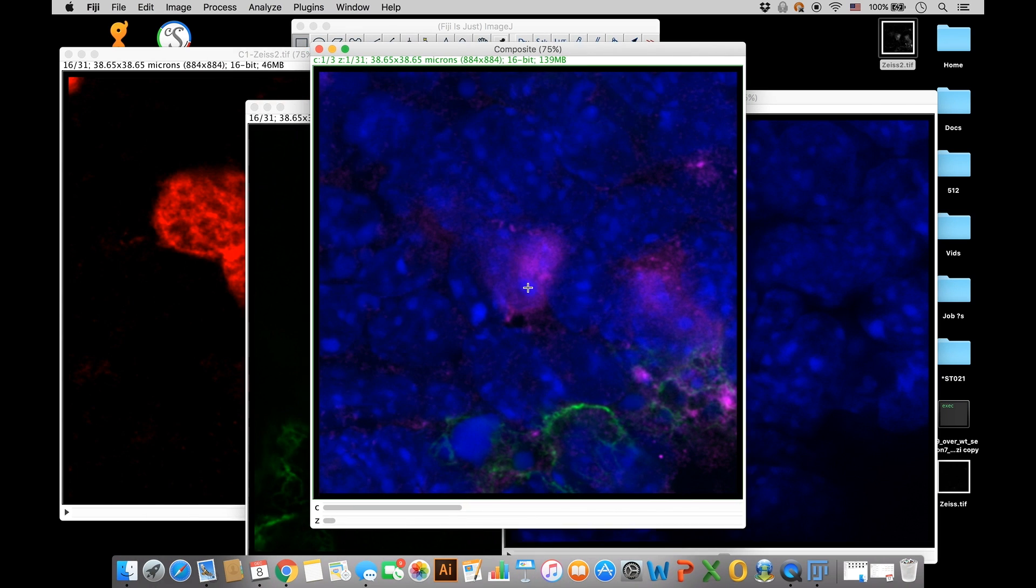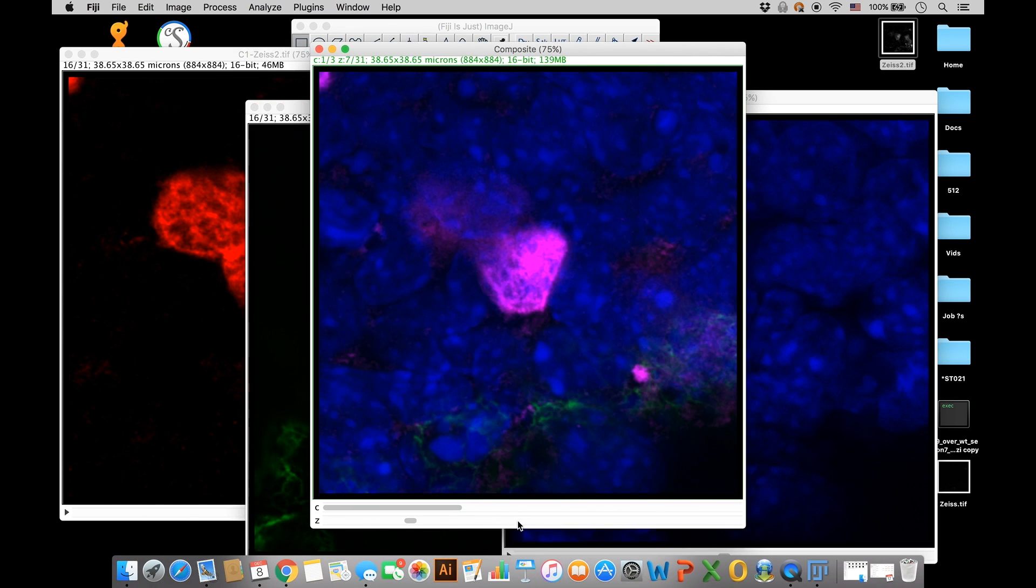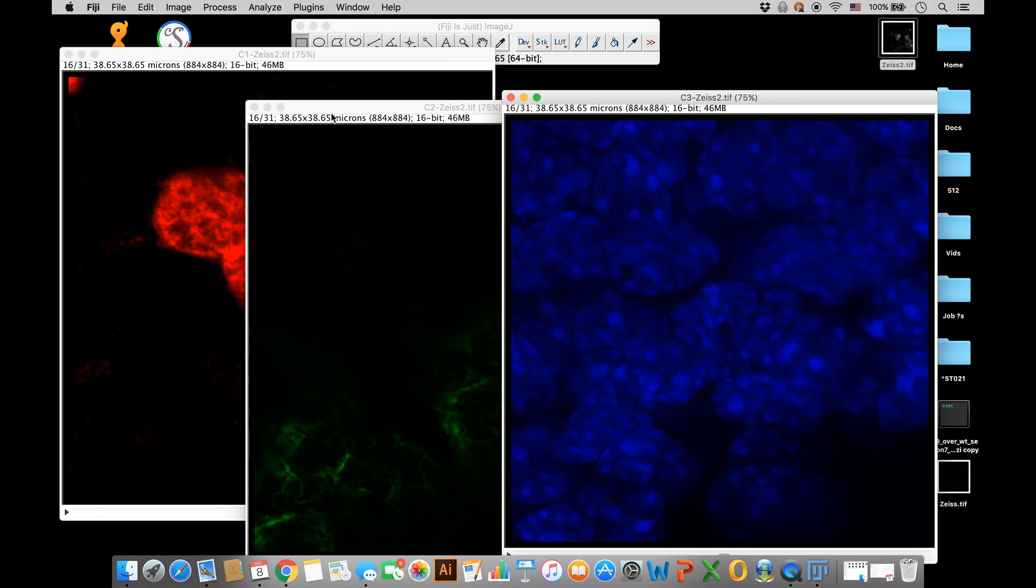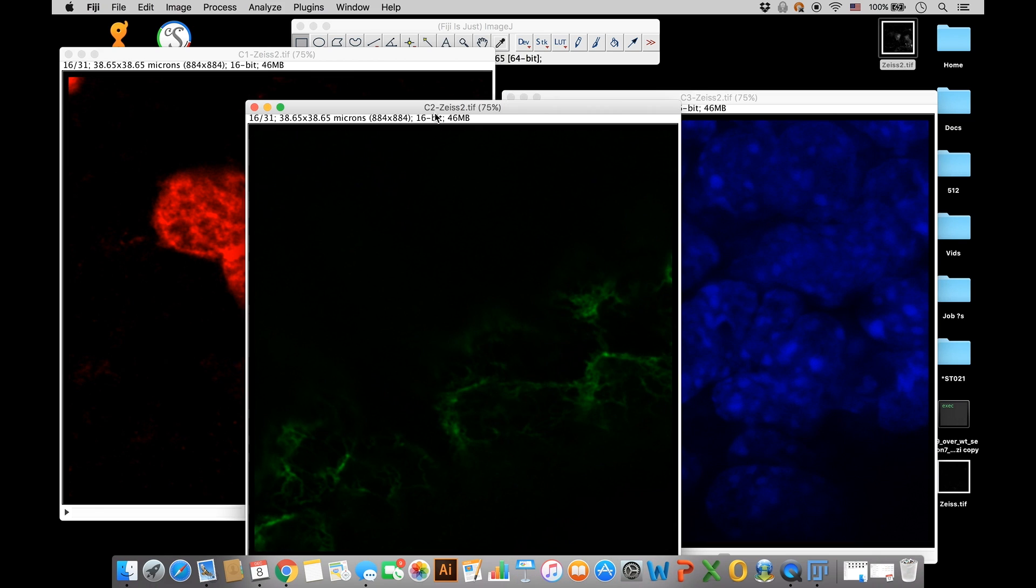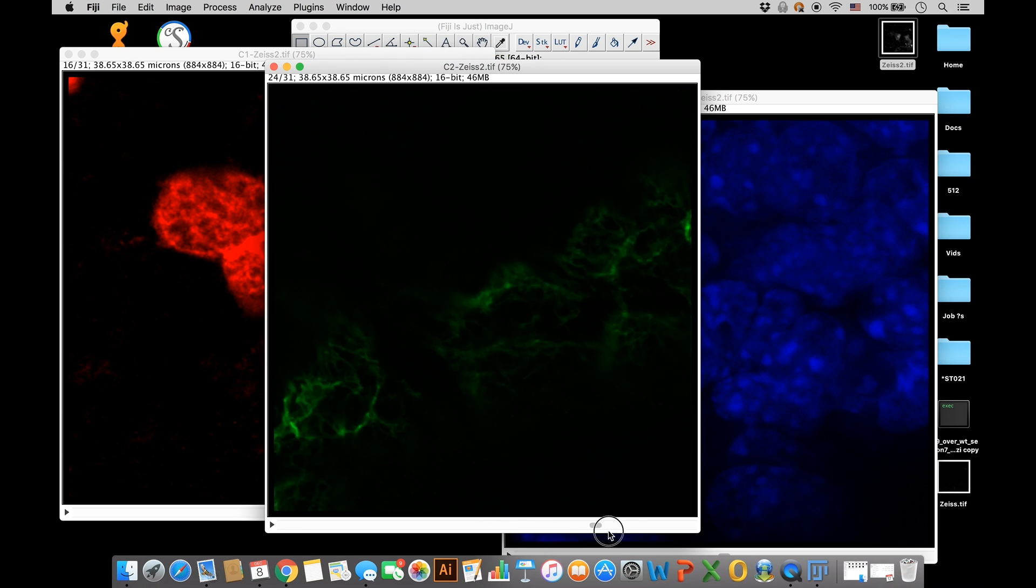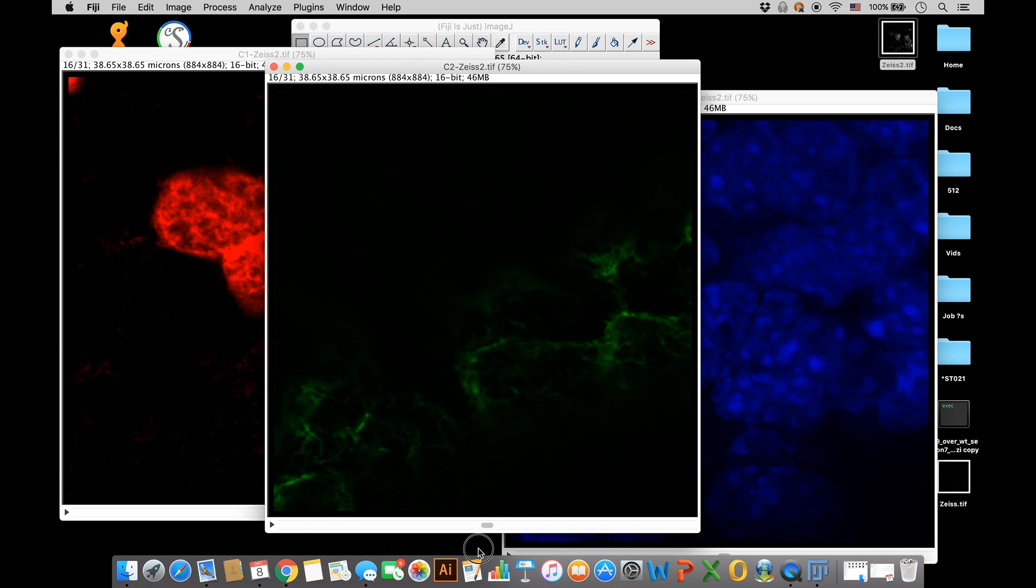Now you'll see that this red channel is now magenta. You can also do that with any of your other channels. You can do them all at the same time, change all the channel colors, and that's helpful if you have a grayscale microscope image file, because I know sometimes people like to save all their images into grayscale.